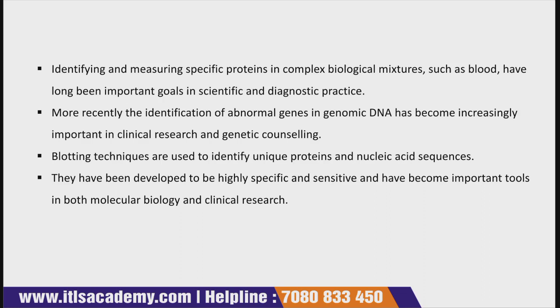So whenever you want to identify or measure any specific protein in a complex biological mixture, for example blood, it is an important goal in scientific as well as diagnostic practices.